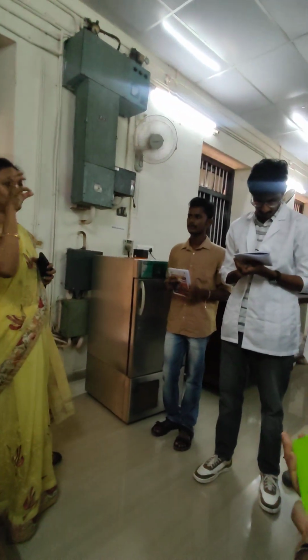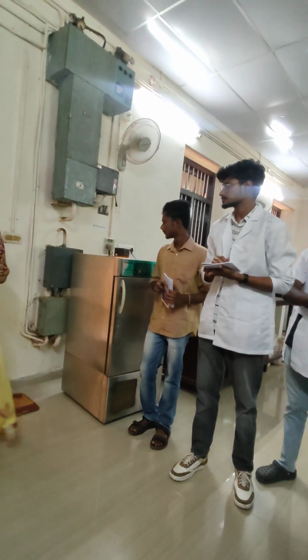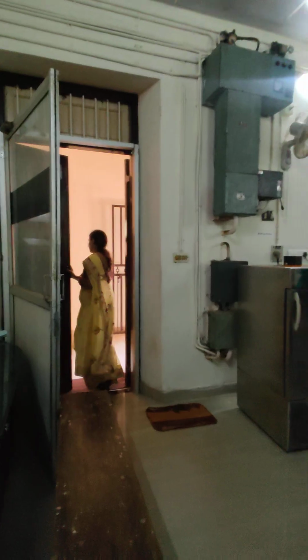Then in the laboratory we have this atomic absorption spectrophotometer. AAS is used for measuring the micronutrients, and the flame photometer is used for measuring the potassium and other bases. So that is also available, that we can see.